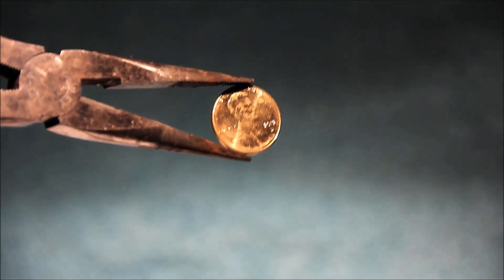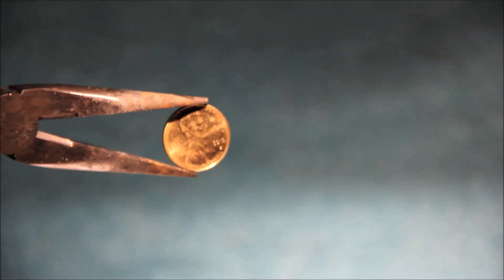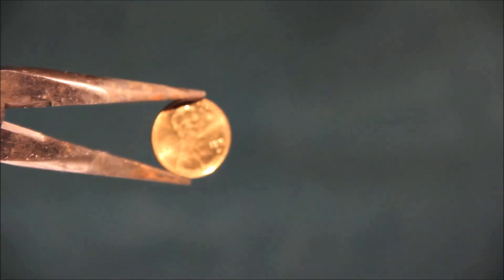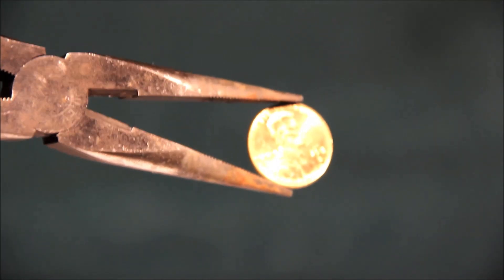So here's the penny after heating. I'm going to adjust the light so you can get a better view of it. Now you can clearly see the golden shine the penny has. It really does look like gold. And that's how you make a golden penny.